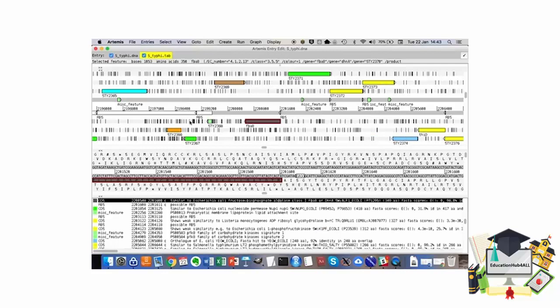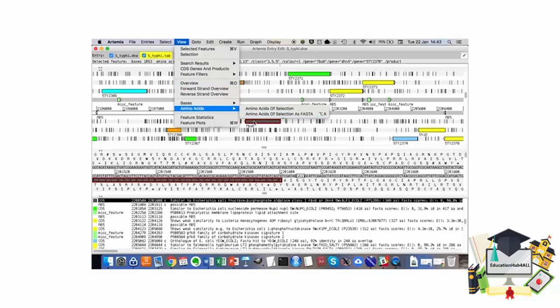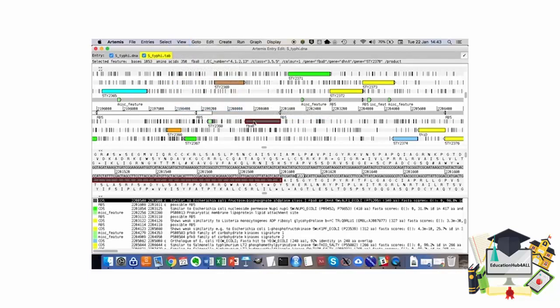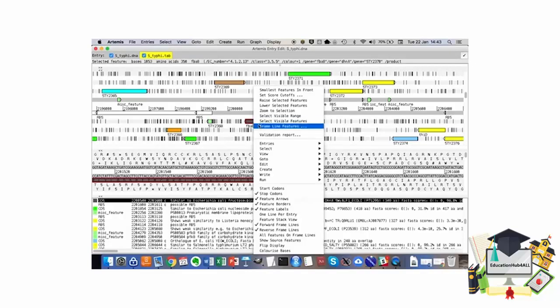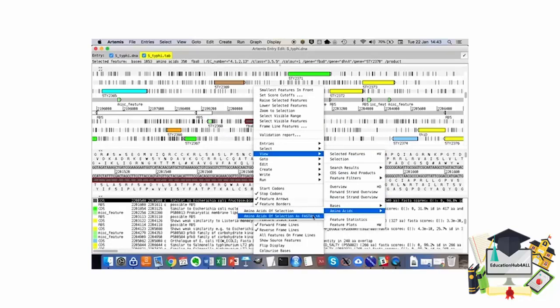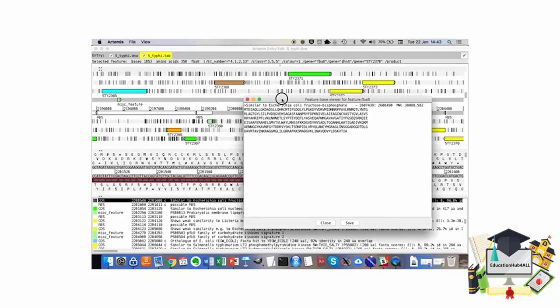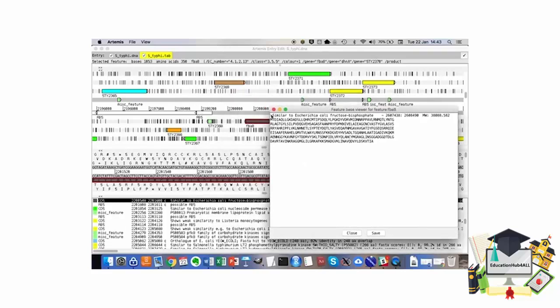We can also visualize the amino acid sequence, either going through the same process—View, Amino Acids, Amino Acid Selection of FASTA—or we can access the same menu by double clicking on the feature, going to View, Amino Acids, Amino Acids of Selection of FASTA. Notice that this menu reproduces the one that is on the top banner. Here opens a new window where we can see the amino acid sequence of the protein FBAB.